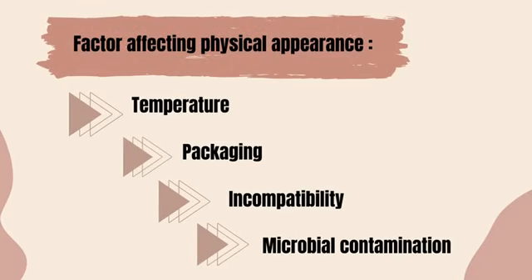We have 4 factors affecting the physical appearance of the cream and the ointment. First, temperature. Second, packaging. Third, incompatibility. And the last one is microbial contamination.